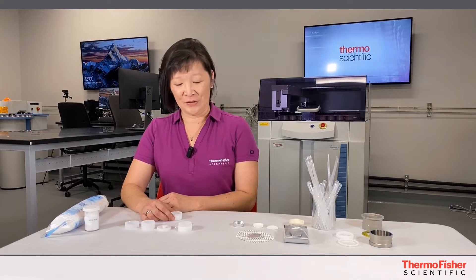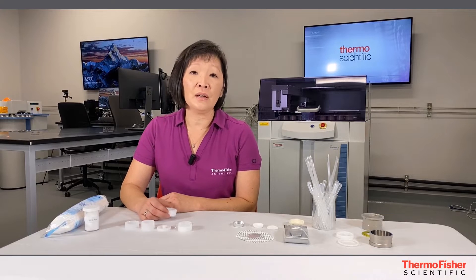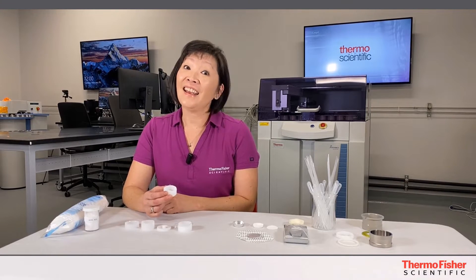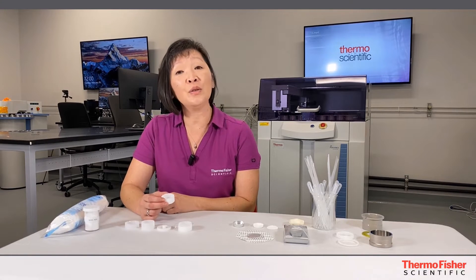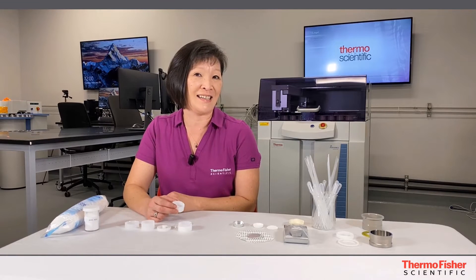Welcome back guys to the G&T Show. If you followed along in our previous show, Glenn made fun of the loose powder racing against the pressed pellet. So in today's episode I'm going to show you how to improve the sensitivity of the loose powder by running under vacuum, but there's a trick so watch and see.